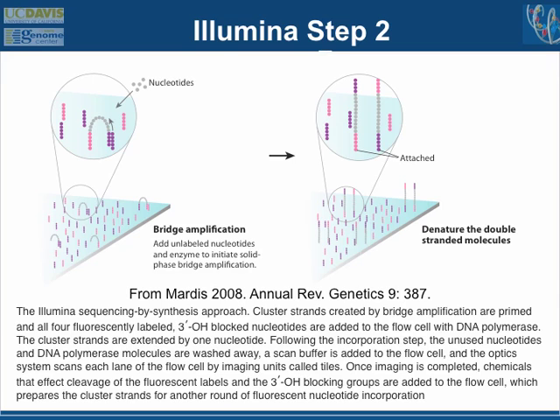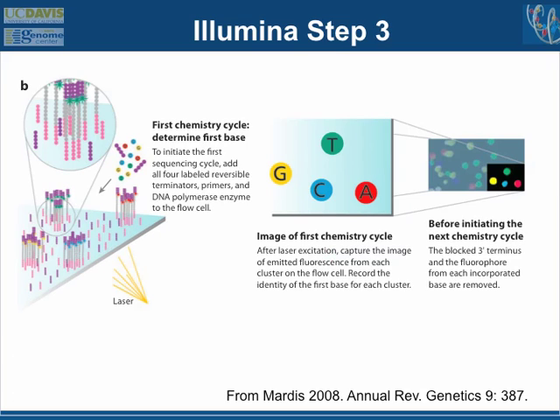Eventually you get these clusters where one region of the plate contains lots of copies of that original piece of DNA, now attached to the plate. It's completely brilliant, and really quite cool.